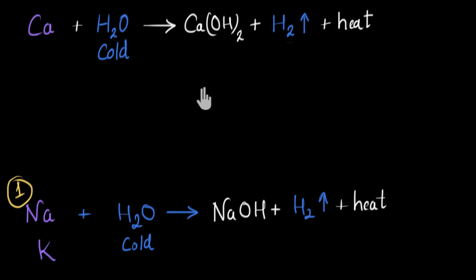But let's compare the heat being released here with the heat being released in the case of sodium. In that case, the heat was so much that it would even burn the hydrogen gas escaping out, right? But here in the case of calcium, the heat is not sufficient to burn the hydrogen gas.